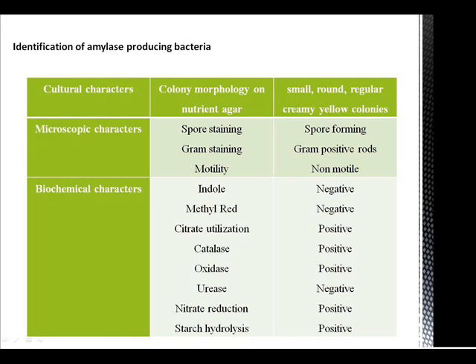Isolation is followed by identification of amylase producing bacteria. In this we study cultural characters like colony morphology, and microscopic characters like spore staining, gram staining, and motility. Various biochemical tests are conducted and confirmed as amylase producing Bacillus.